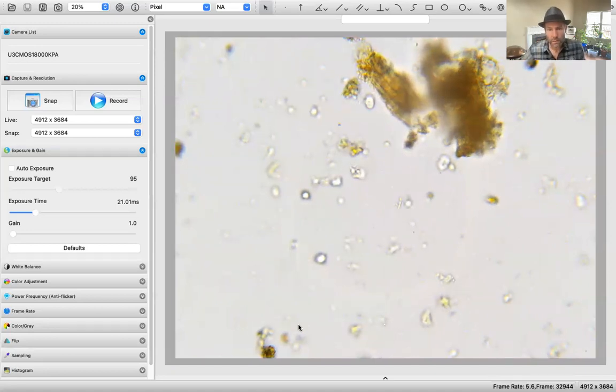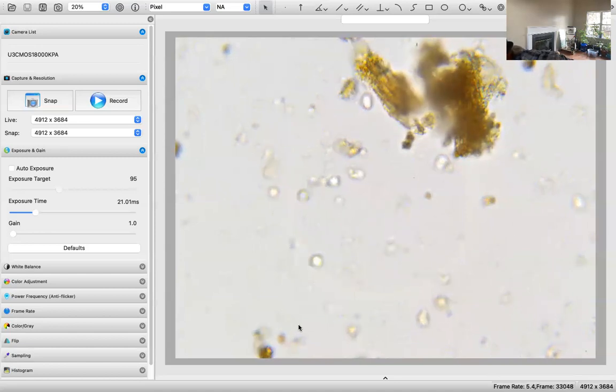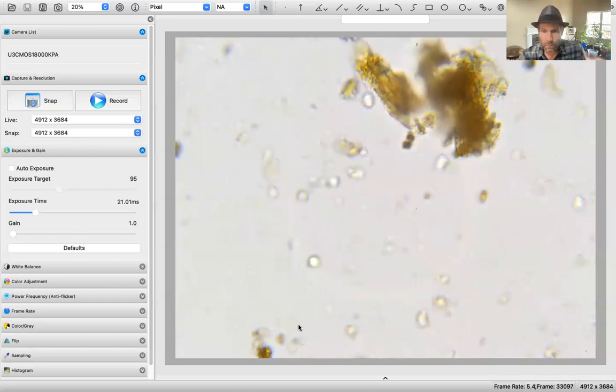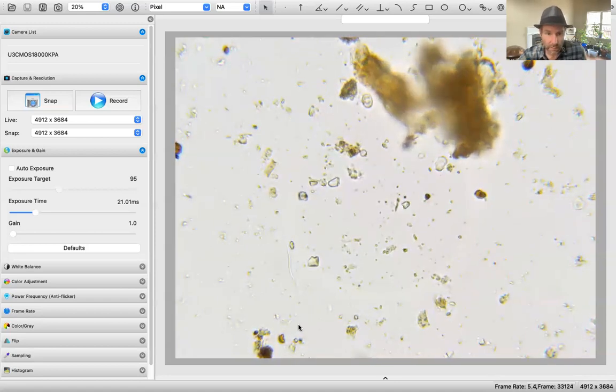I'm going to look through the microscope just to make sure I don't bump anything. That is not an arcella. There is no opening. It looks like an opening the way it is there, but through the microscope, it's definitely no opening.